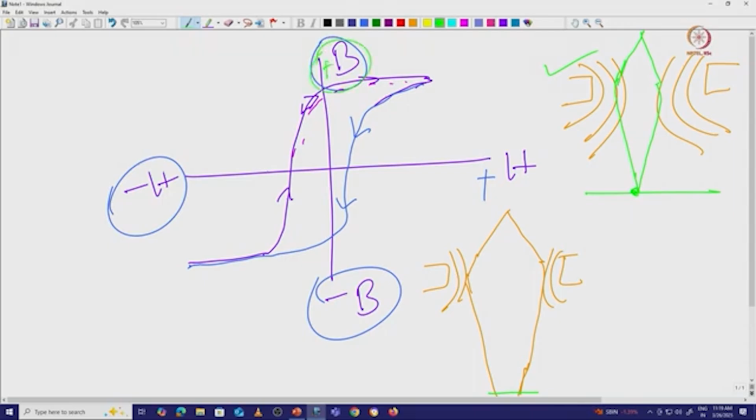Here this is the positive point I am using, and my magnet, the soft iron electromagnet, is completely saturated. Then suddenly I want to use the same electromagnetic lens at a very low or different magnetic field, and it has to start from here and come back to this particular position. If you look at the magnetizing force, when it is going it is in a different position than when it is coming back. These two points are different, with a different magnetizing force, and that is going to affect the magnetic field that converges or diverges the electron beam. That is the problem, and that is the reason we have to remember lens hysteresis, otherwise it will be a problem.